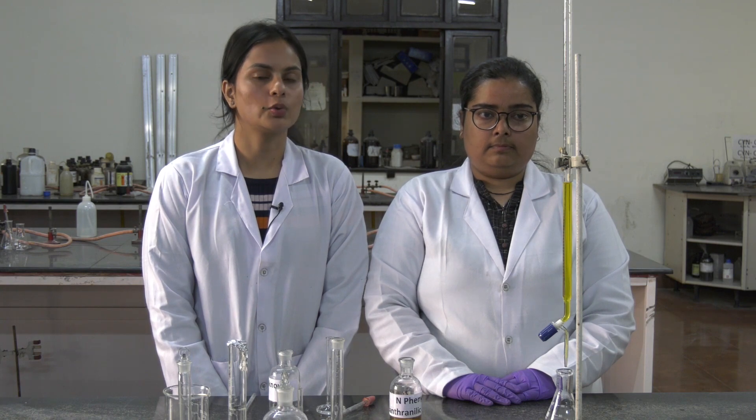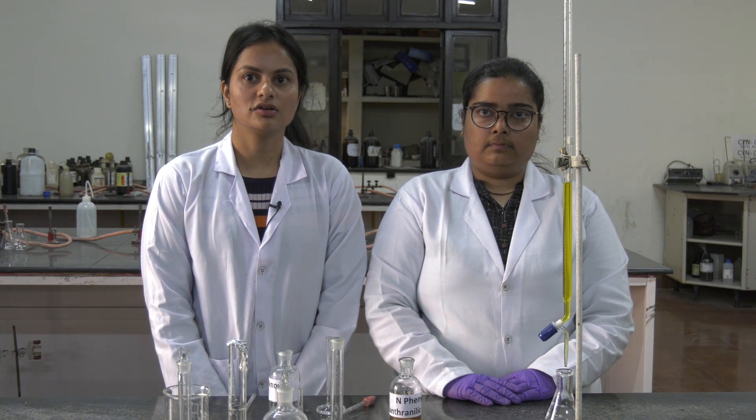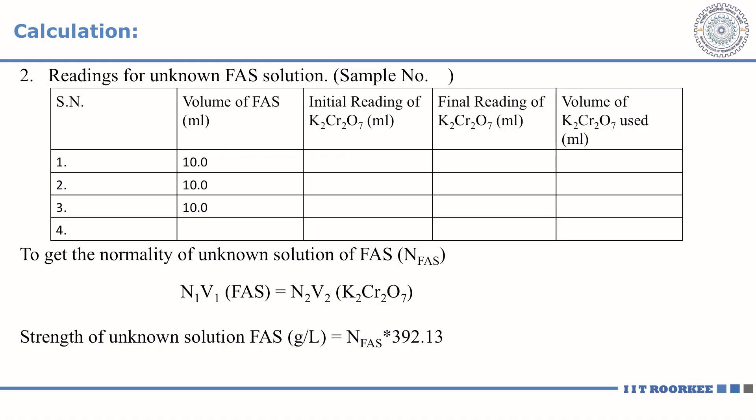For the titration of the unknown solution of ferrous ammonium sulphate salt, the initial reading of the burette was 20 ml and the final reading was 34.8, so the change is 14.8. Repeat this experiment to get concordant readings. After completion, determine the normality of the unknown solution using the formula N1V1 = N2V2, and then determine the strength by the formula: normality multiplied by the equivalent weight of Mohr salt, that is ferrous ammonium sulphate solution.